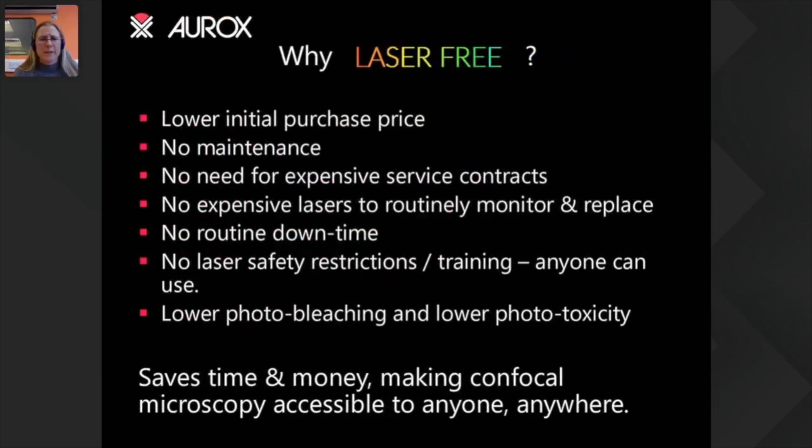So firstly, why did we decide to go laser-free? I think you'll see in Tony's keynote lecture in a little while that you do not need a laser to do sectioning, to do confocal microscopy. He actually will show you a really interesting image from a historical slide. So why laser-free? Well, it's cheaper, it's easier to maintain.